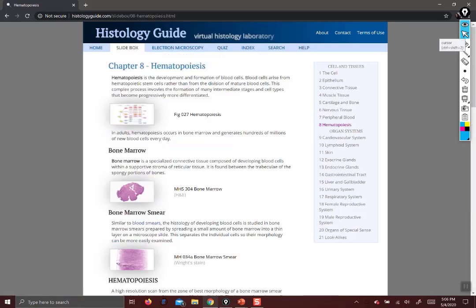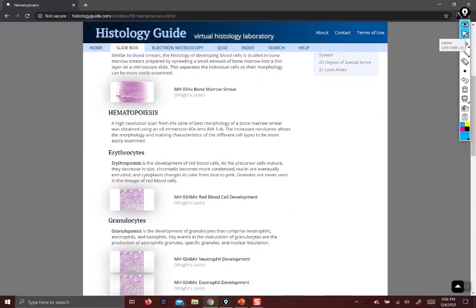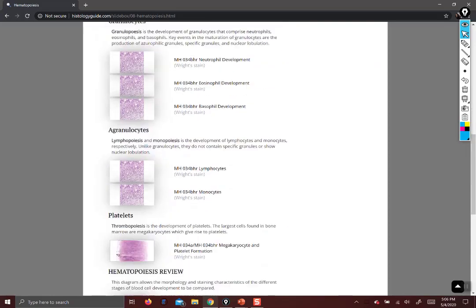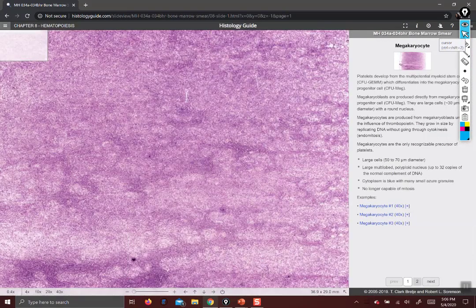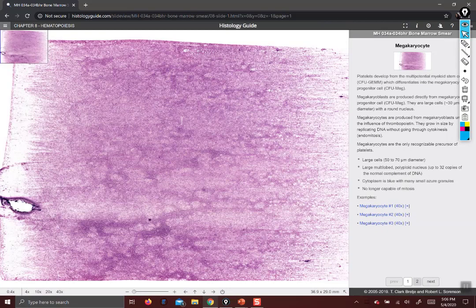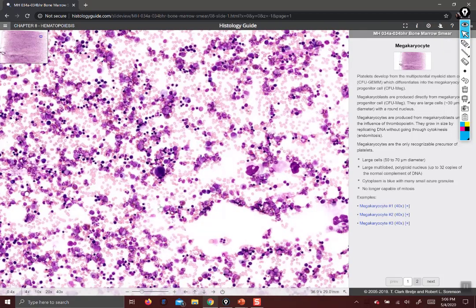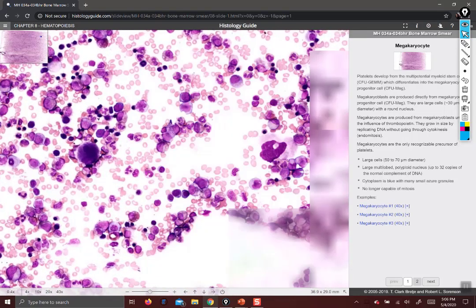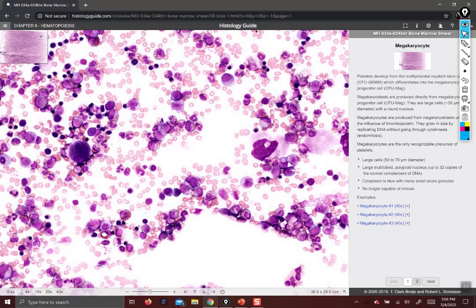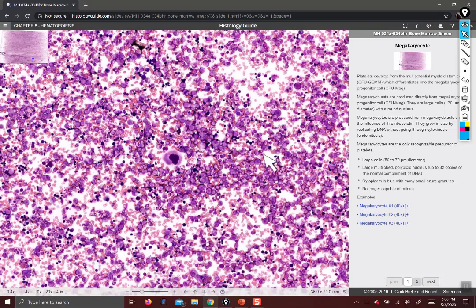If you want to see a megakaryocyte, let's click this quickly — just for fun, I'm not going to test you on this. I want to show you megakaryocytes, which are the cells that platelets come from. So there's one, and here's another one. What these cells do is stick a little foot out into the sinusoidal capillaries of bone marrow, and then pieces of their little foot break off. That's how platelets are formed — pretty neat.